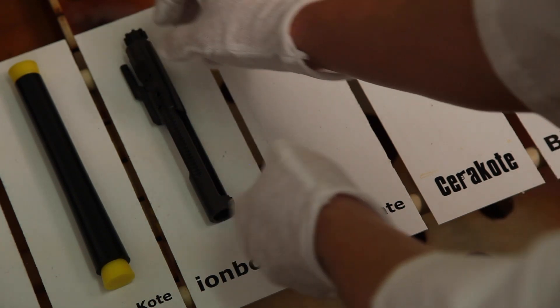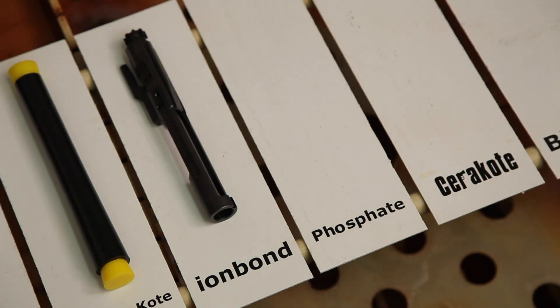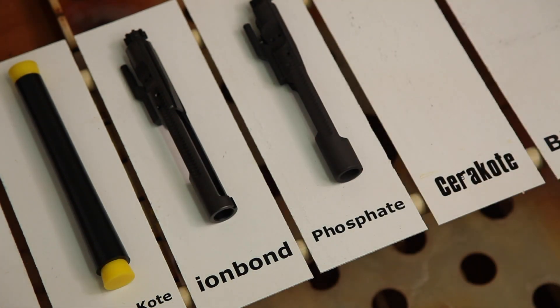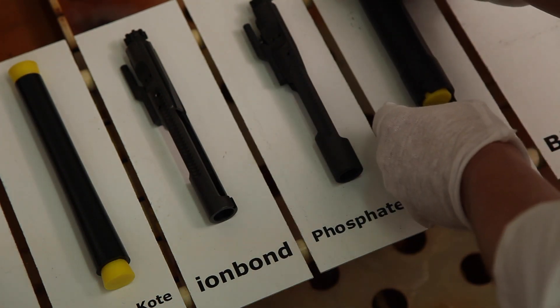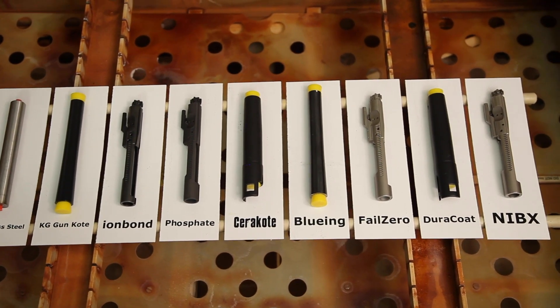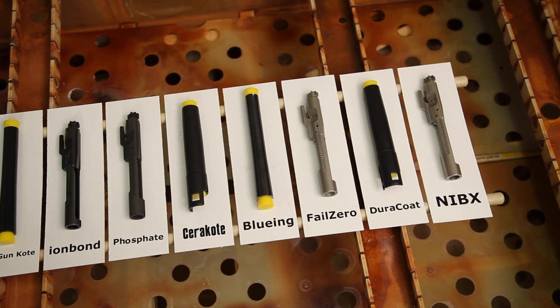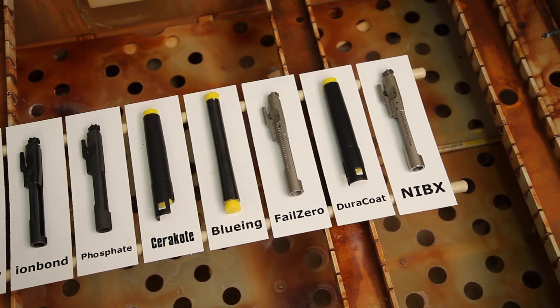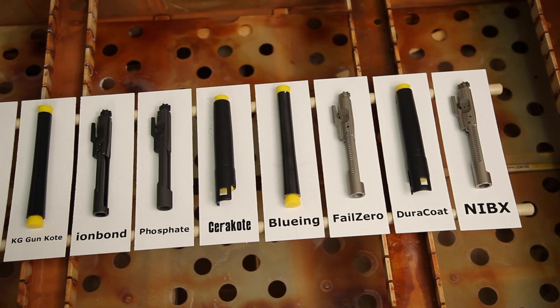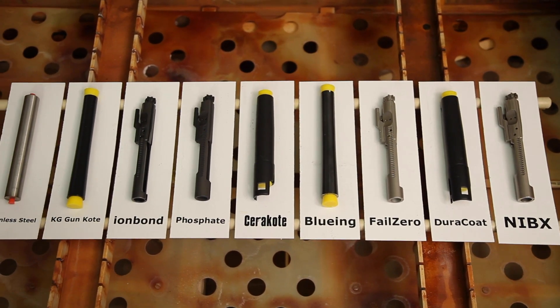At that point, time will be noted for that particular finish. Not all test components are identical. In order to achieve the most accurate test results, finished parts were sourced directly from the manufacturer if available. Components that required application, including Cerakote, were coated on cut sections of the same mild steel barrel, which ensured a consistent base metal on all test pieces, guaranteeing an accurate comparison.